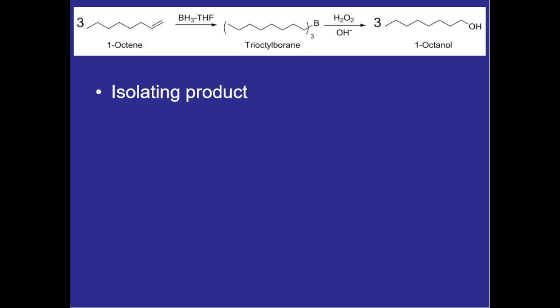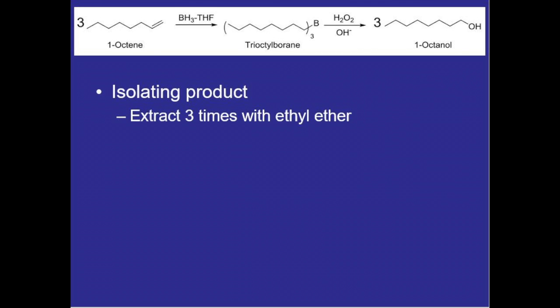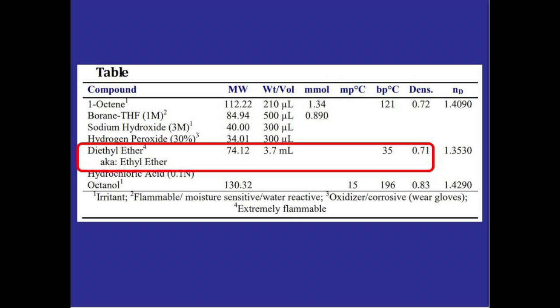Once the entire reaction is completed, we will extract our product using ethyl ether or diethyl ether, which is less dense than water.